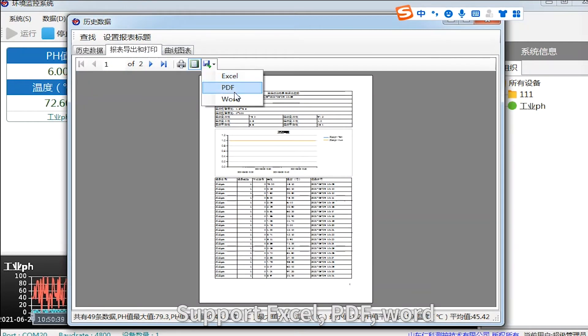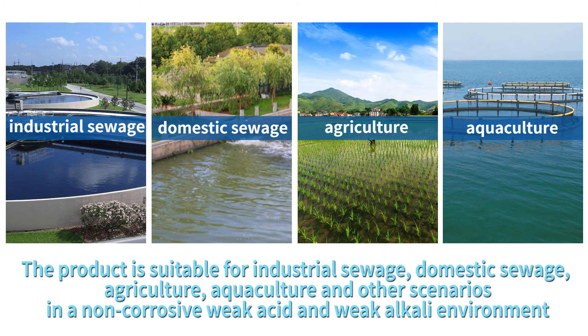Historical data can be exported in Excel, PDF, and Word formats. The product is suitable for industrial sewage, domestic sewage, agriculture, aquaculture, and other scenarios in non-corrosive, weakly acidic and weakly alkaline environments.